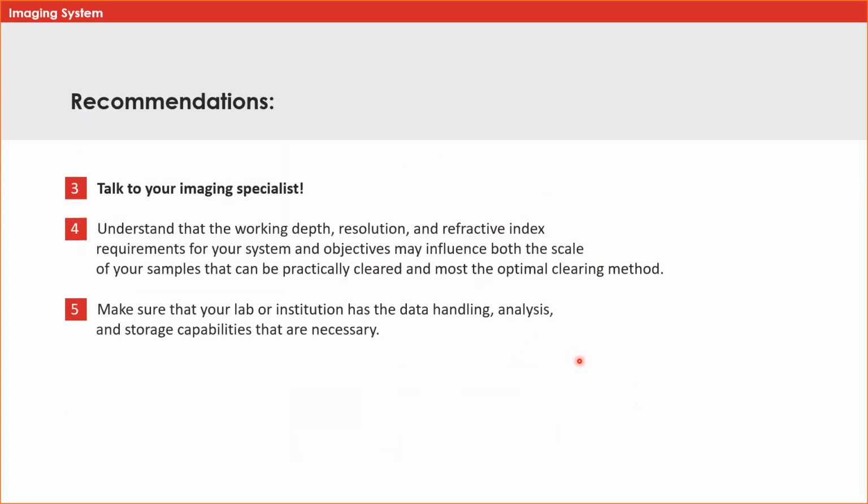From our perspective, with regards to imaging systems, one of the best pieces of advice we think that we could provide, and we hope that you would follow, is to talk to your imaging specialist. Your imaging specialist for your institution or department will be invaluable to your efforts. Share with them what you want to do, find out what is available for you to use, and seek their advice for their best approach to take.